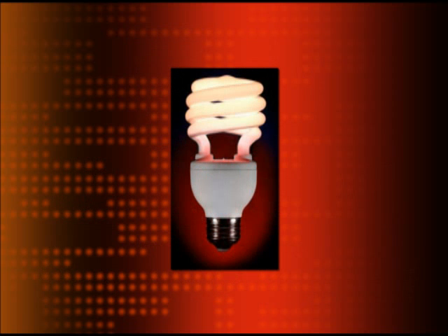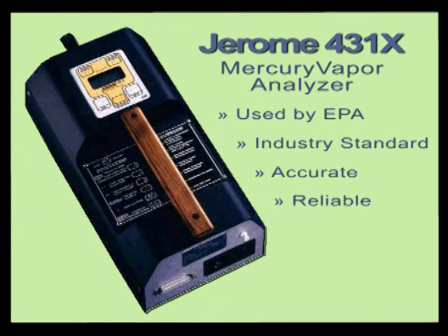We wanted to find out just how much mercury is emitted from broken compact fluorescent light bulbs. To measure this, we selected the Jerome 431X Mercury Vapor Analyzer. We chose this instrument because it's the same one used by the EPA. It has been used in the remediation and toxic cleanup industry for years and is known to be accurate and reliable.